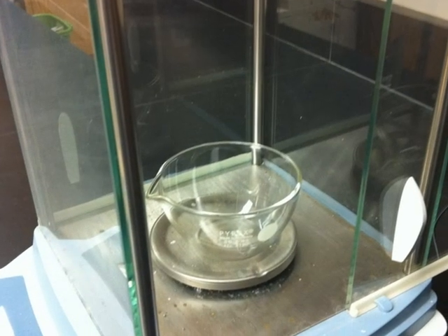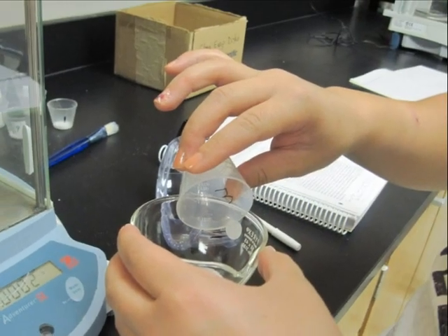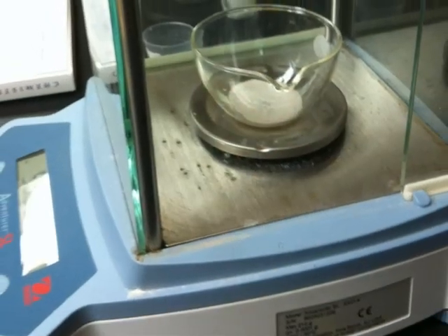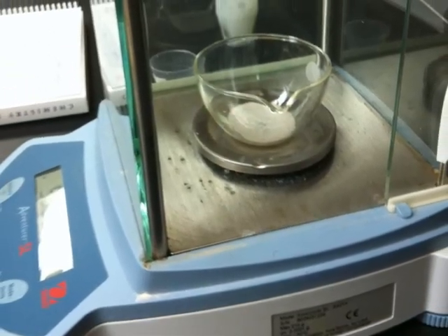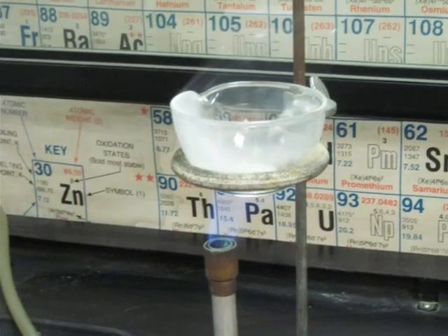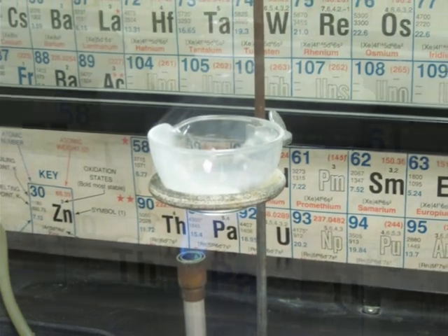Determine the mass of a dry, empty Pyrex evaporating dish. Transfer the unknown to the Pyrex evaporating dish. Weigh and record the mass of the sample and the dish. You will heat the sample to sublime the ammonium chloride. Be sure to do this in the fume hood.